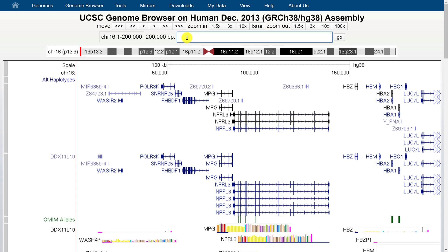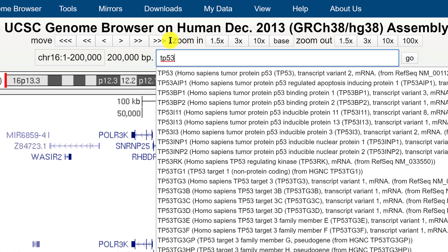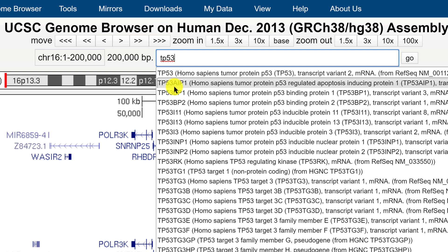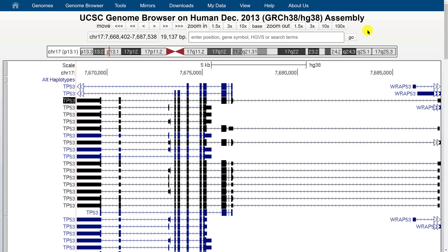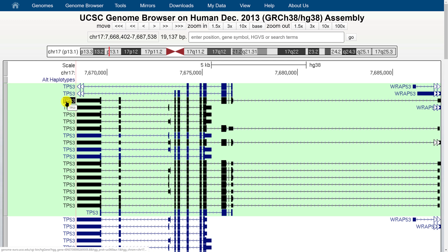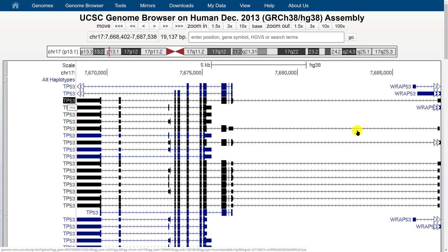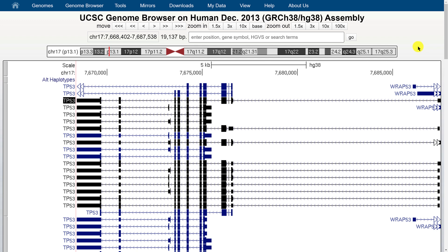If I type in 'tp53', a dropdown menu appears with all genes and transcript annotations containing that search term — you can see tp53 the gene and lots of transcript variants. Click on tp53 and the coordinate automatically updates, but you still have to click 'Go' to navigate there. Now we're centered on the main annotation for p53 and you can see the many alternative transcripts. You can also search for exons and other specific sequences.